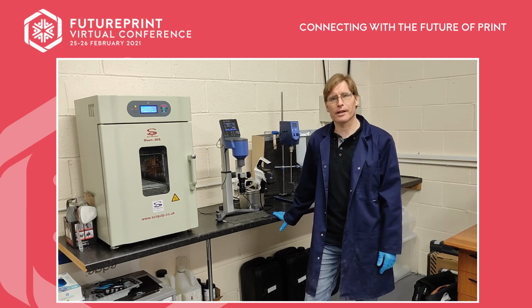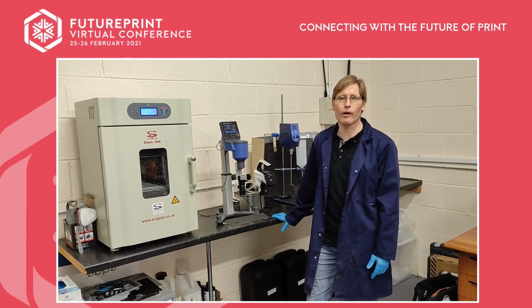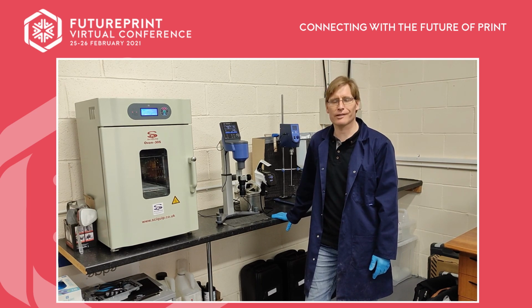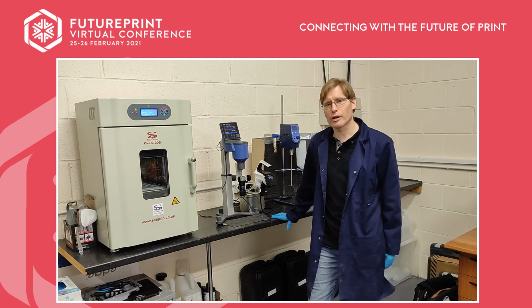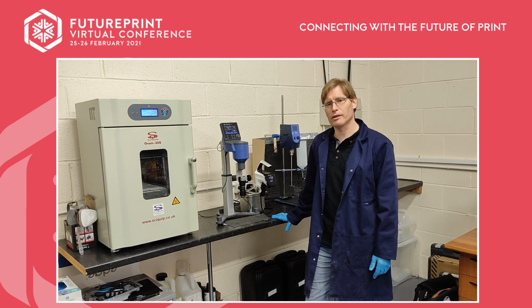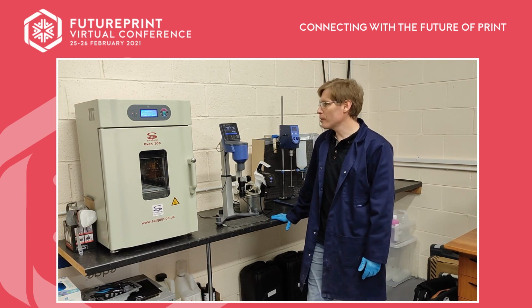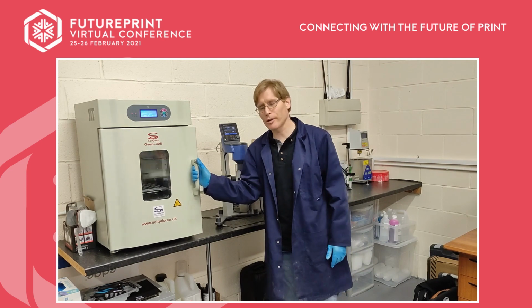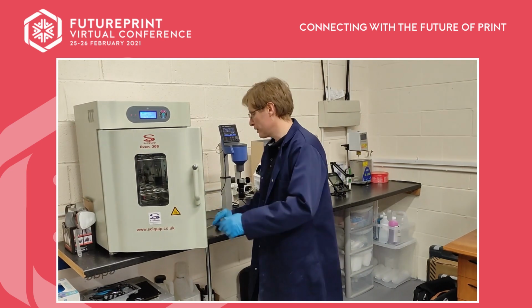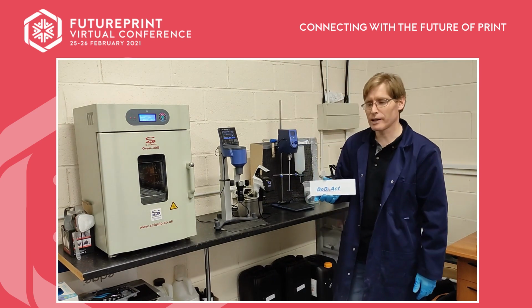In this part of the DoDxAct's lab, we look at the inks when they come in, or we make fluids for our own internal testing and understanding. We also have a drying oven here for drying prints and doing materials compatibility. So let's just look at what we're doing now. At the moment, there's a print in here. A print we made earlier of the DoDxAct's water-based.